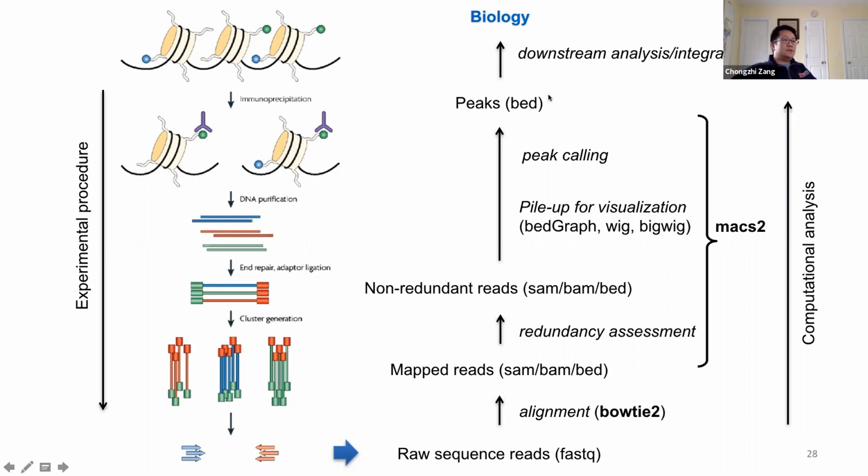Having these peaks identified, the next step is how to integrate this information, and then we'll use downstream analysis and data integration to integrate the data and to get the biological information from there.